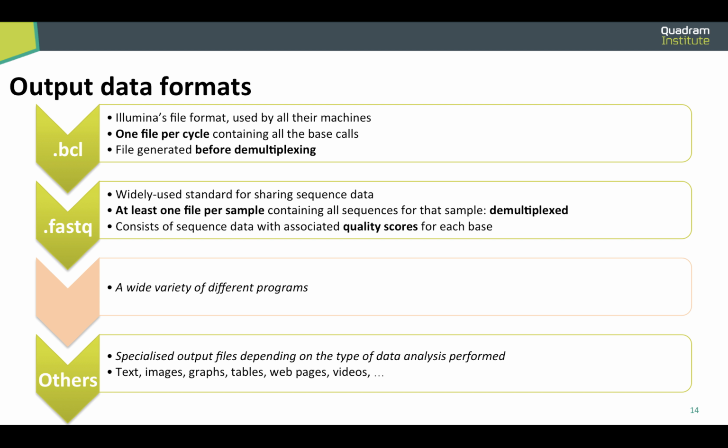So that gives you a rough overview of what you can do in BaseSpace. There's a lot more other stuff that I don't have time to go into now, but when you do your own sequencing, you can play around in BaseSpace, see what kind of information they have. And Illumina have very good documentation around it all that tells you exactly what you're looking for and how to identify whether it's good or bad data as well.